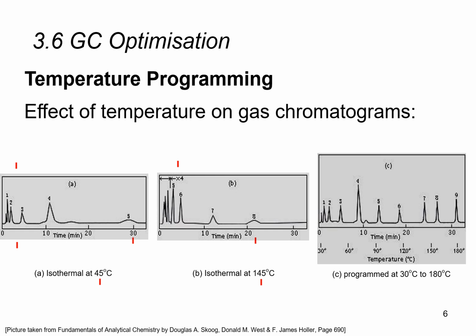But the problem is that on the left of the chromatogram, if you have all the lowly retained compounds eluting very quickly, then of course all of them are mashed together and not well separated. So you can see that there are a whole bunch of peaks, up to 6 peaks, mashed together at the front of the chromatogram. Therefore, it will be impossible to separate or to identify these peaks.